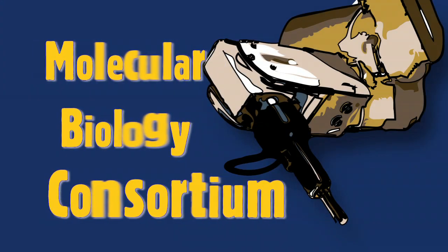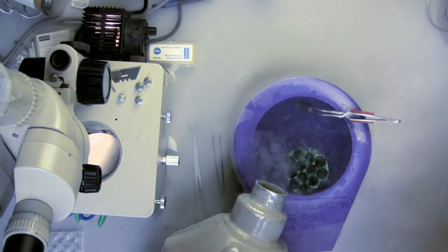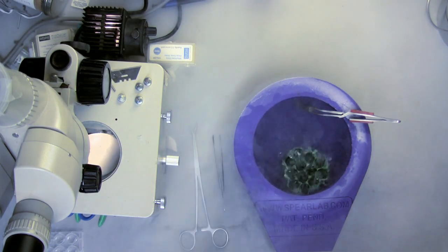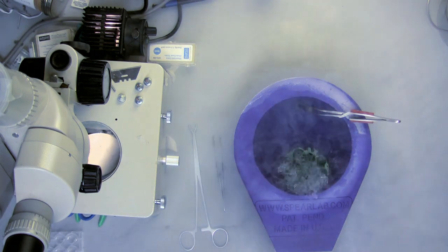Welcome to the MBC training series. Today we'll demonstrate techniques on sample handling and loading for the Rigaku pucks. Consider these suggestions based on what I do here at the beamline. If you have a technique you like better, please send it in to me at jcnicks at lbl.gov.